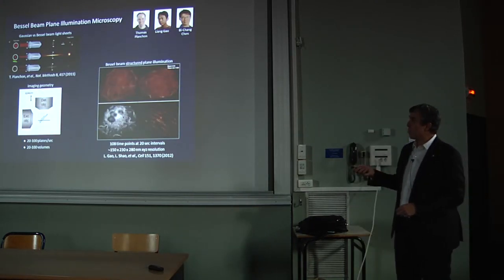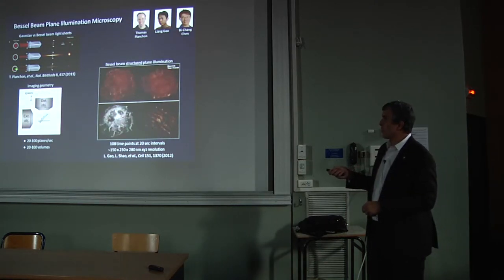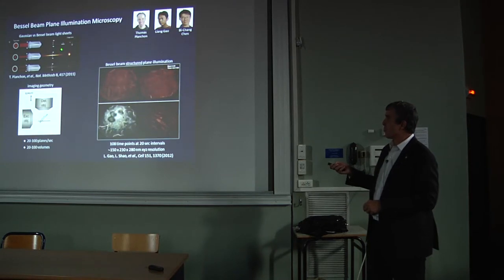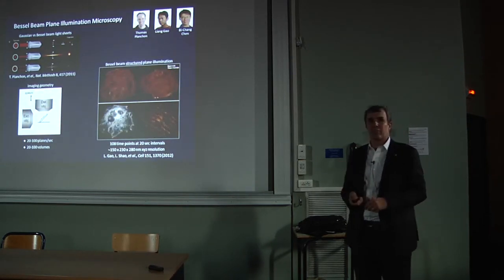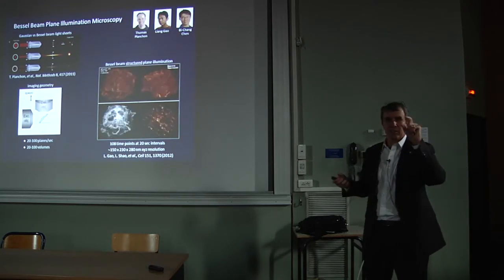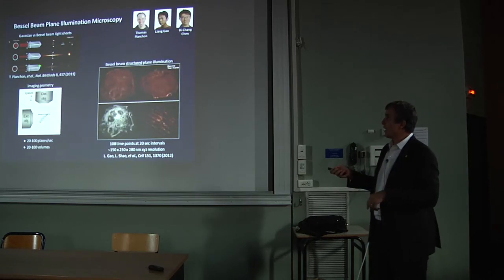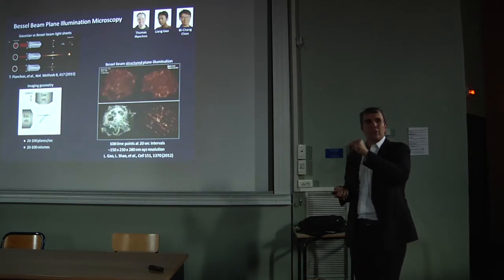particularly using a Bessel beam. So in a Bessel beam, you illuminate your lens not uniformly like when you're going to create a Gaussian beam, but instead with an annulus of light. And now you have two knobs to tweak, the diameter of the annulus and the thickness of the annulus. And that allows you to decouple the length of the beam from the diameter of the beam.